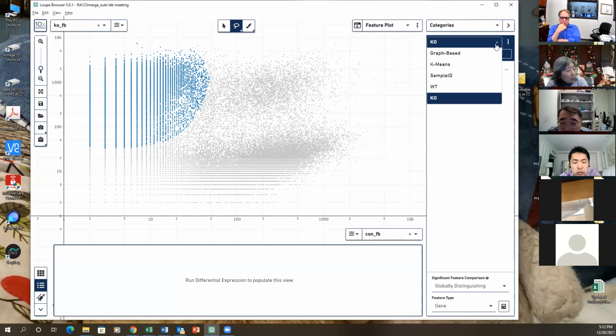You should assign each group only in one, like wild type. Then in this group, you divide the cells into wild type and control. I name WT as a separation. So I give a name in the loop file, I give a separation, then I separate all populations in this big group.